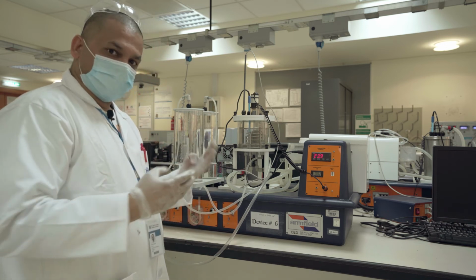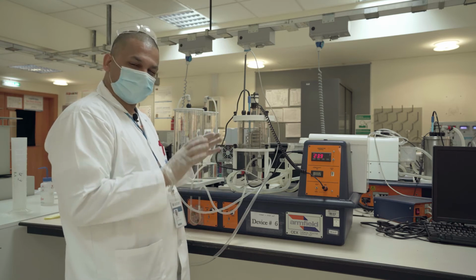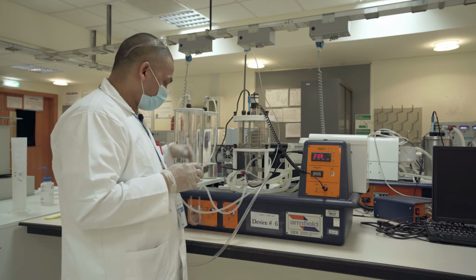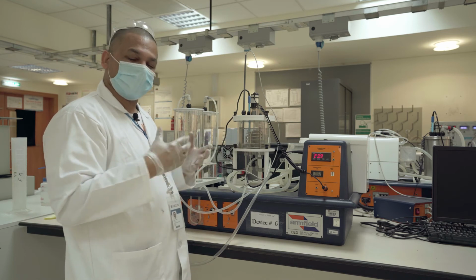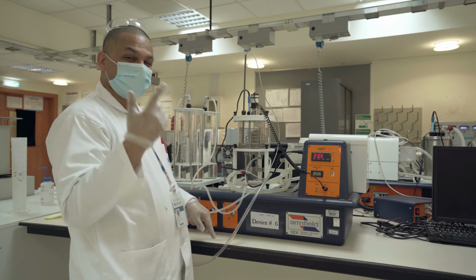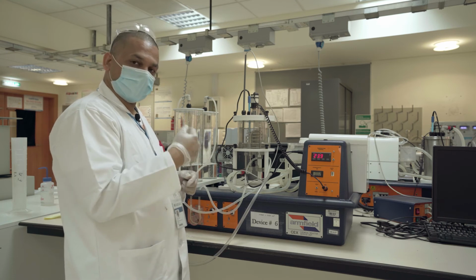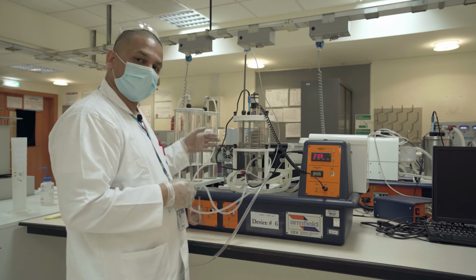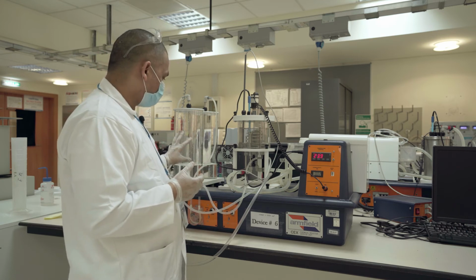Now, of the four parameters that we have, if I want to evaluate them here, the first one is equimolar at room temperature, which will help me calculate alpha plus beta, the overall order of reaction. Then I dilute one of them to make it in excess, and again run the experiment at the same temperature so that A naught and EA are constant. Now in this case, because one is in excess, the order will come from the other reactant only, and that will be alpha. So with these two runs you can get alpha and beta. If you want, you can further dilute it and do another 3 runs, so you double check and get more reliable data. That's the only thing we want to do.